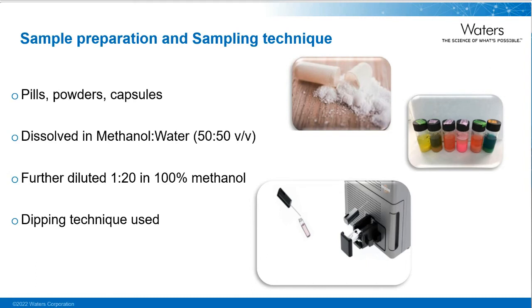For the analysis of the samples, a dipping technique was used, where for each sample, a new glass capillary was selected and cleaned using the Radian's inbuilt automated bakeout procedure. The cleaned capillary was then held just below the surface of the liquid, approximately 1 centimeter, for 5 seconds. After this, the capillary was then placed into the ASAP source.